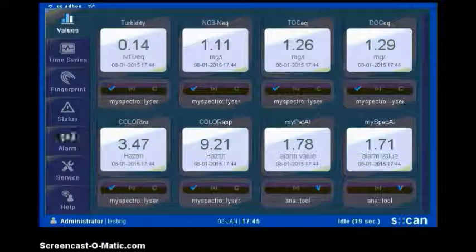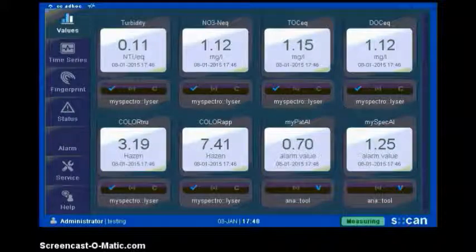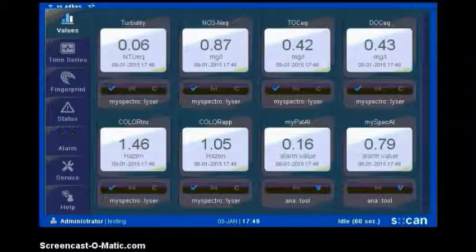The final test that stays now for our system is to check whether the alarm algorithms are going to detect a contamination with the cranberry juice. I'm pretty sure we're going to see an alarm of the spectral alarm algorithm.